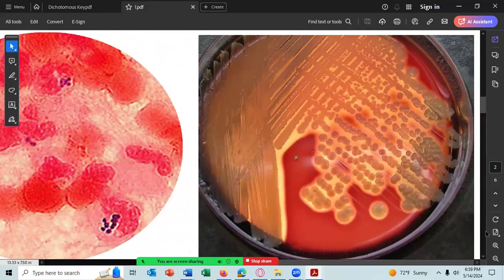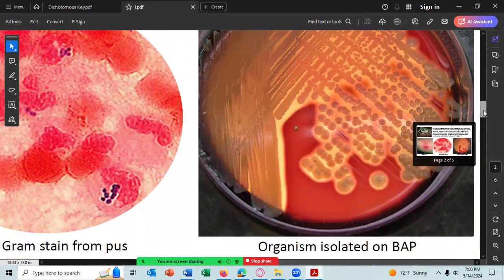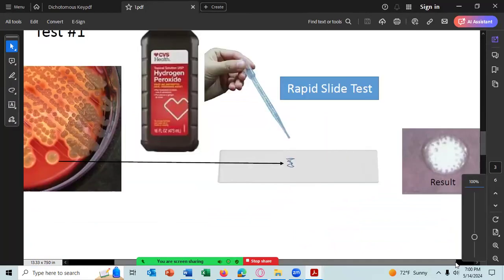And then this is the bacteria grown on blood agar. And as you can see, something's happening here. This doesn't look like a friendly bacteria. You can determine what the hemolytic activity was. Let me shrink this down now, show this better.